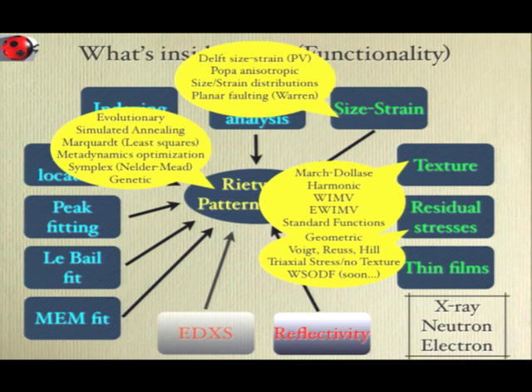And yeah, there were a couple of people developing others for this, like Merkel, for example, you can download. He developed a method that can be put as a plugin in MAUD. So he has a web page that explains how to work with it for high pressure measurement, so a method to get the modeling for high pressure experiments.